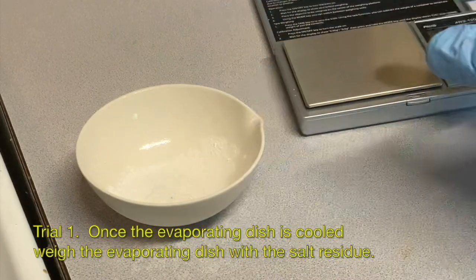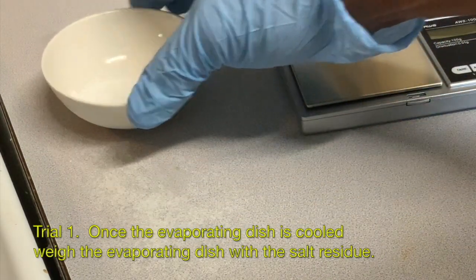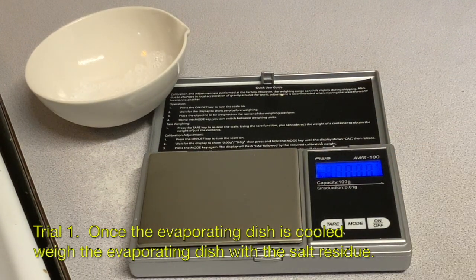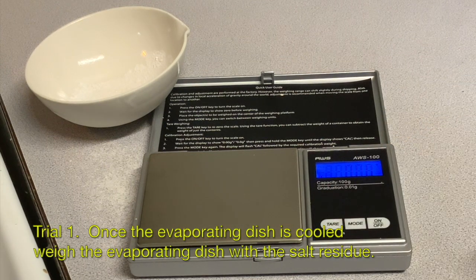When the evaporating dish is cool, go ahead and turn on your scale. Make sure to tare it so it reads 0.